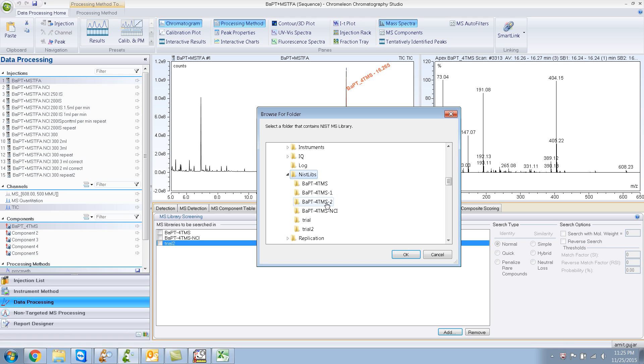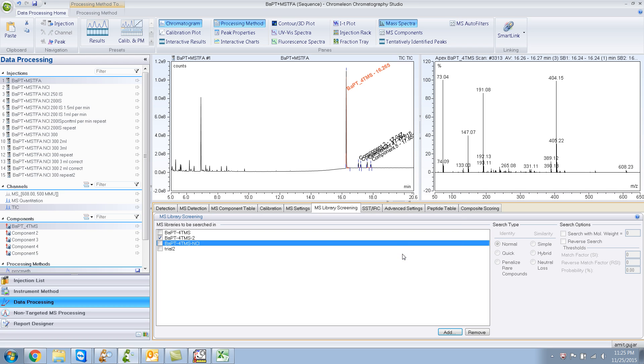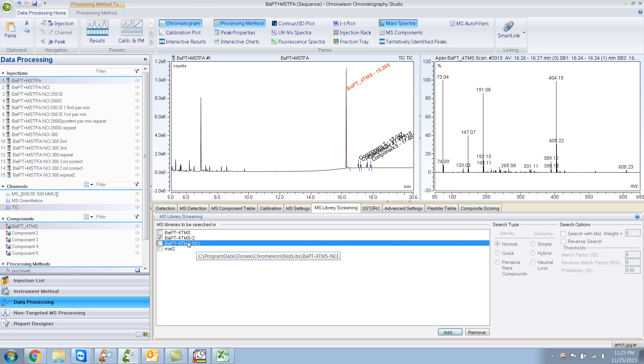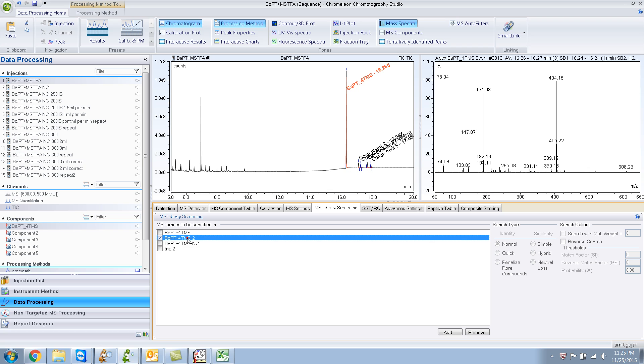BAPT-4TMS-2. Click on that. And click OK. So, right now, the library is added over here.